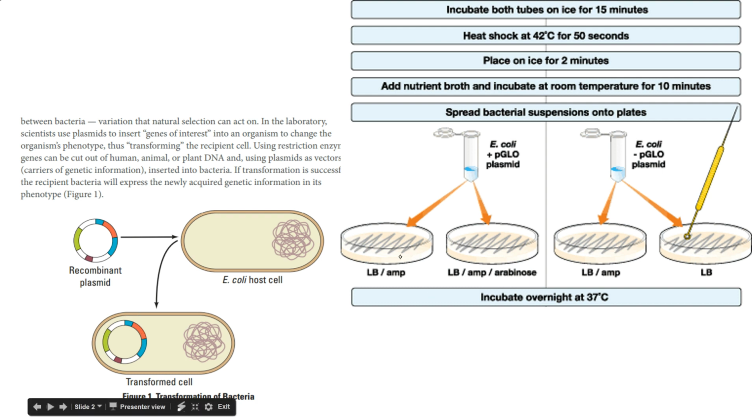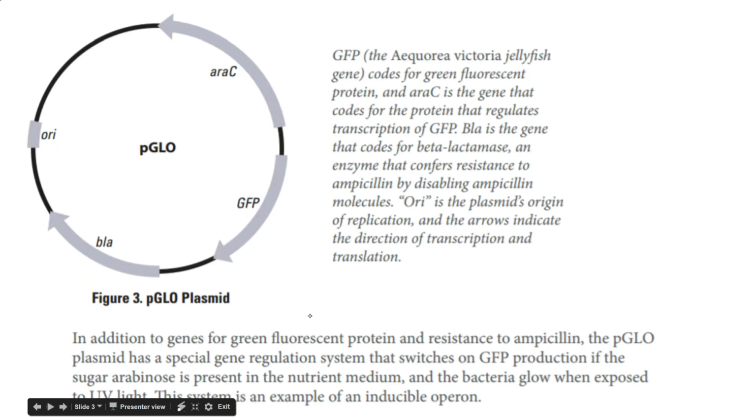And some of that will be successful, but the success rate is really specific to doing the lab correctly. Because if you don't heat shock it, only about 10% of what could possibly be taken up will be taken up. If you do it for 90 seconds, you're only going to get half as many as what you would get if you did it for 50 seconds. So it's this specialized way to get the E. coli receptive to picking up plasmids from the environment.